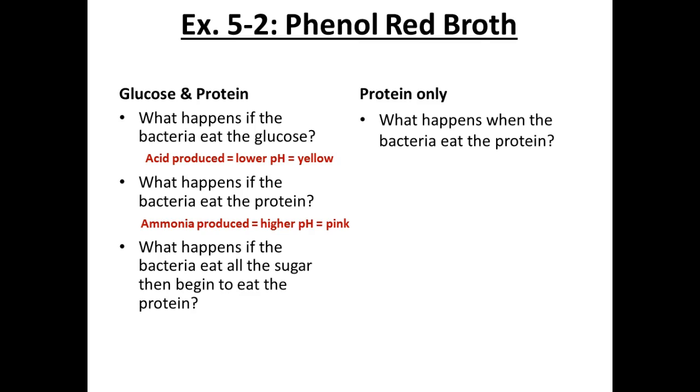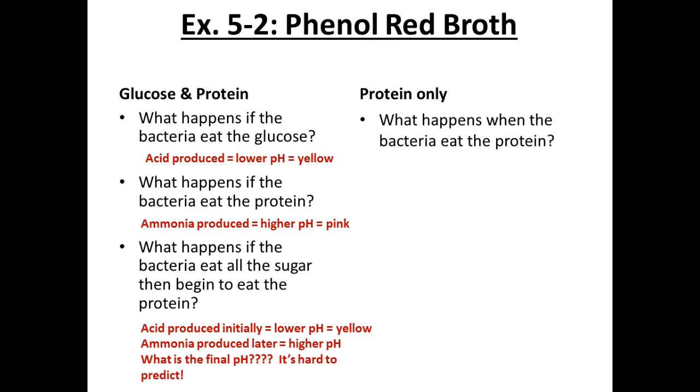A couple of you guys have one of those organisms, right, that if I don't stick it in the fridge, then it just keeps going, and it will eat up that sugar. It'll eat up all that sugar and then go right to the protein. So those organisms are kind of like me. I'll eat the candy while I'm cooking the hamburger because I just can't wait, right? Sugar is fast energy, right? Some organisms will use that very quickly, and then they're going to move on to the protein.